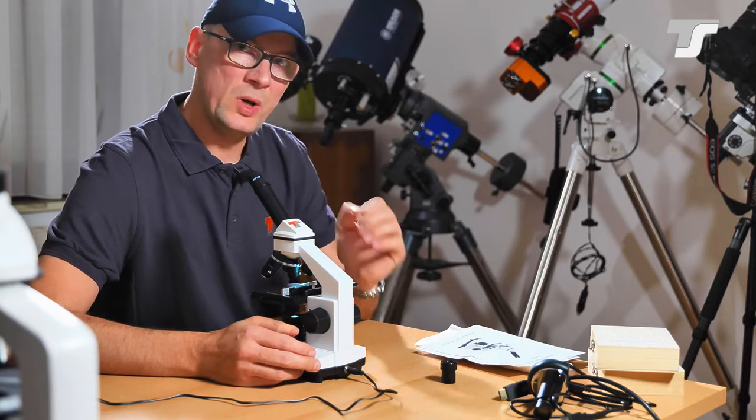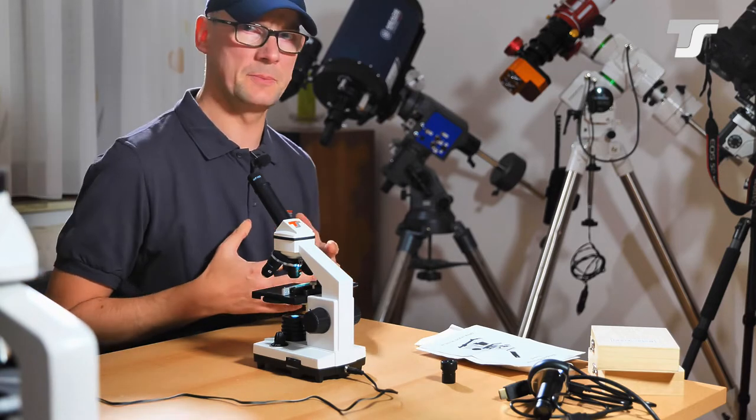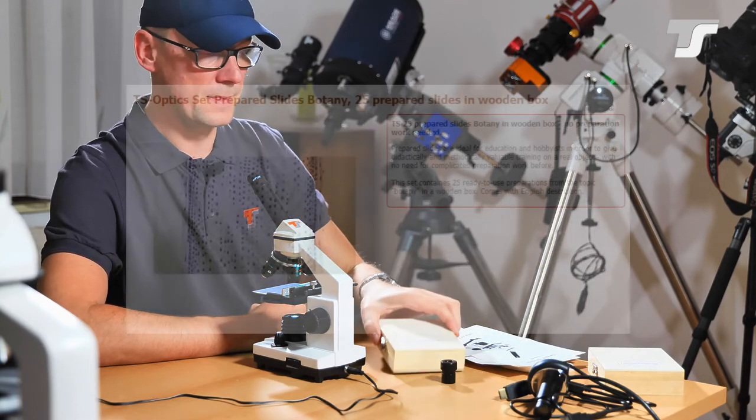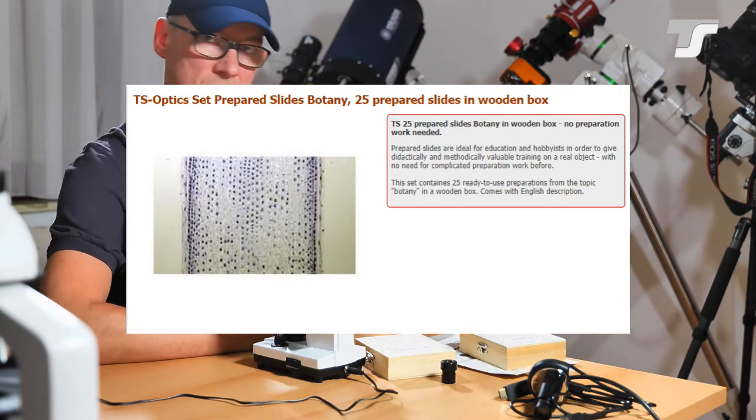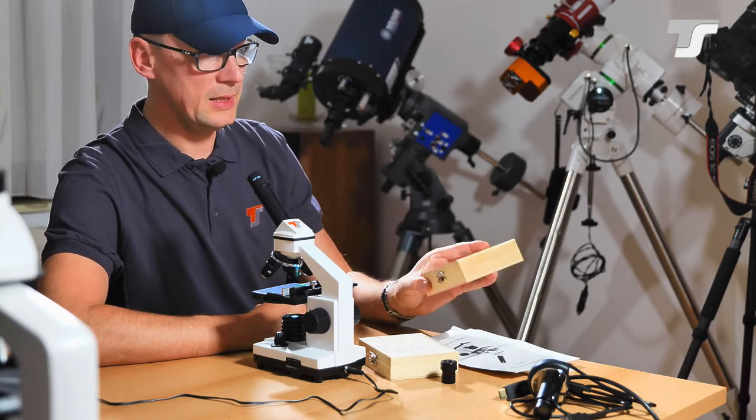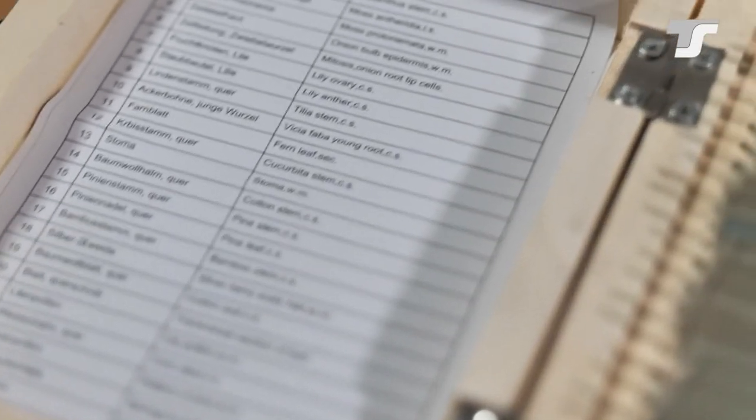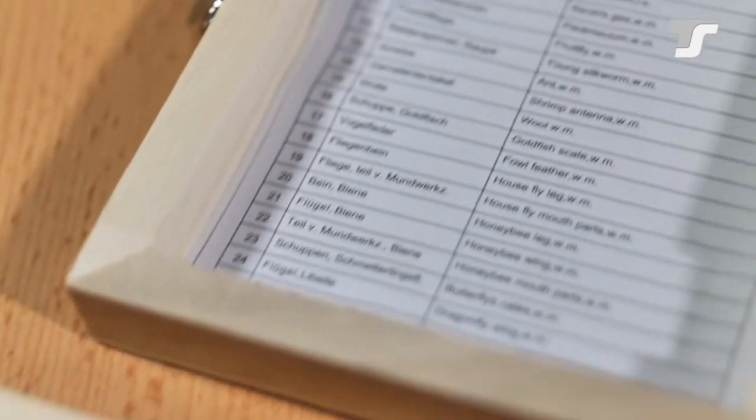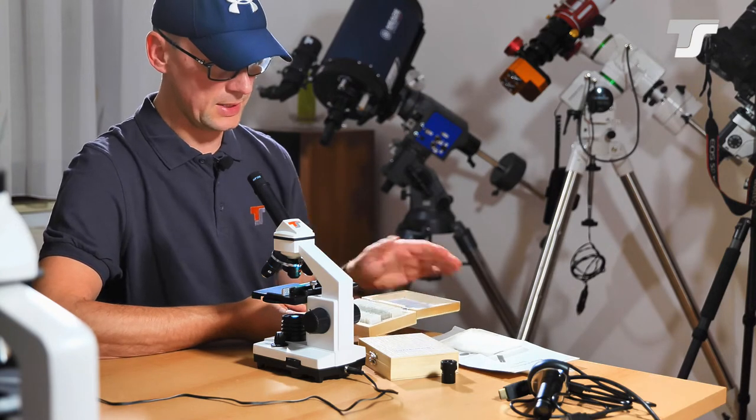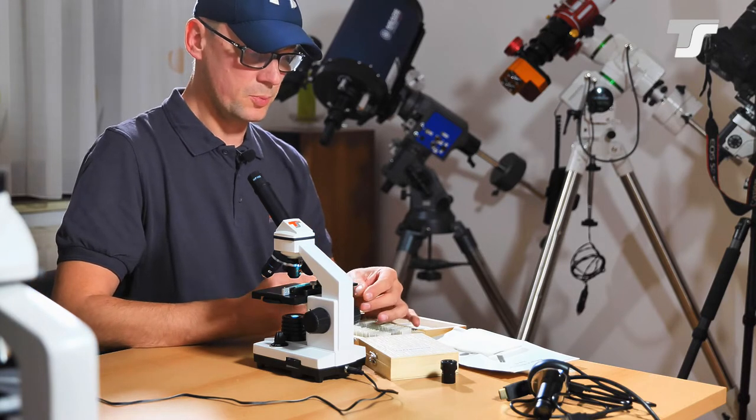And now you have multiple options how to start. For example, if you want to start really out of the box, super quickly, don't want to mess around with preparing subjects, then we offer you some sort of these. These are prepared samples. I chose for this demonstration botany and zoology. In each box there come 25 prepared samples in a really nice tiny wooden box. There's also a sheet of paper in it with the description of every glass plate that you can find here.